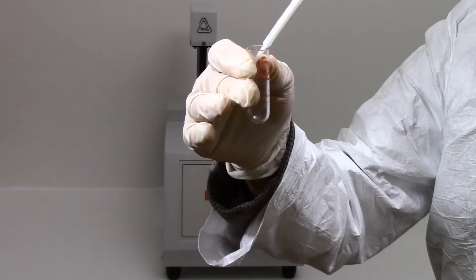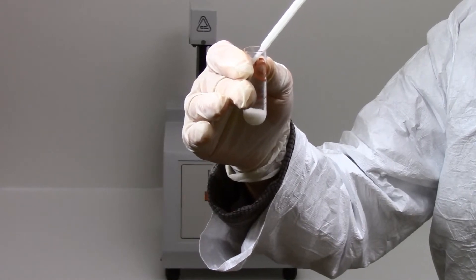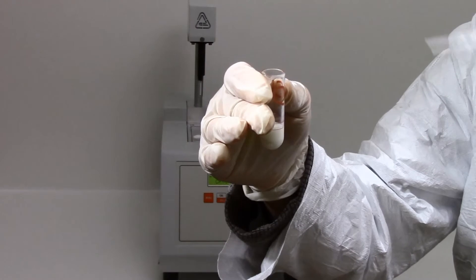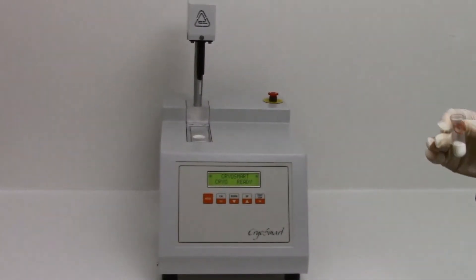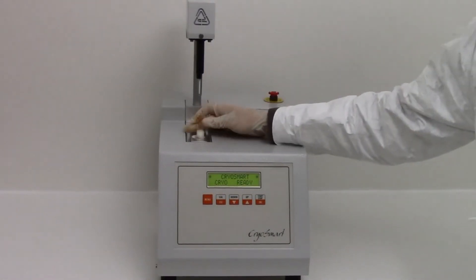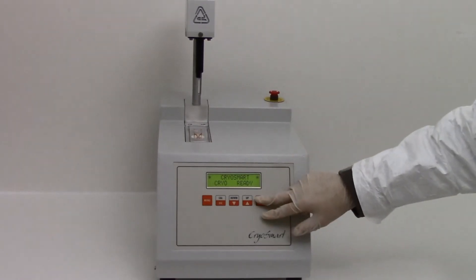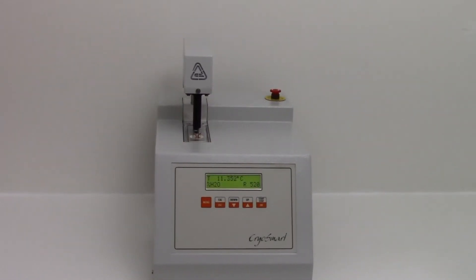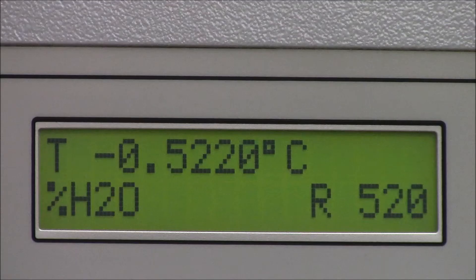Just take a sample tube and fill it with milk. Then put it inside the duct and press the star key. The equipment will automatically carry out the measurement, then the cryoscopic point and the percentage of added water will appear on the screen.